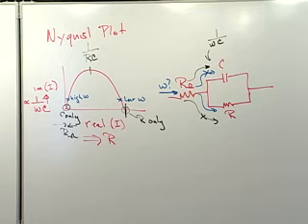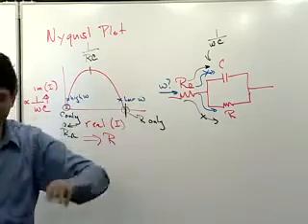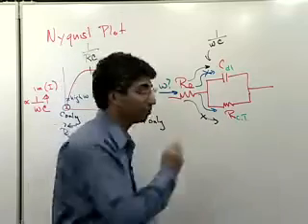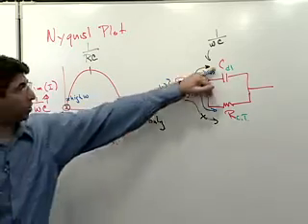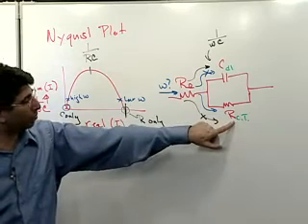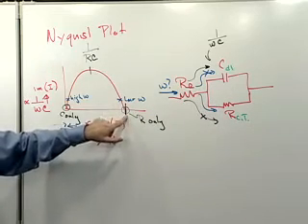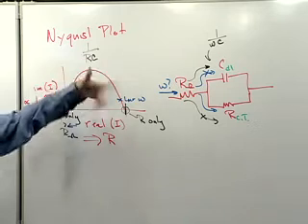And now all I have to do is say, well, it's not an electrical circuit with components in it that I'm interested in, but what I'm really interested in is a double layer here and a charge transfer resistance right here. And now you can see if I have a way of measuring the value of these components, which I obviously do over here, then I'm going to back out the charge transfer kinetics and the double layer properties of this system. So typically, I would figure out this point right here by extrapolating to 0 frequency, and then use the maximum over here to come up with the capacitance once I have the resistance.